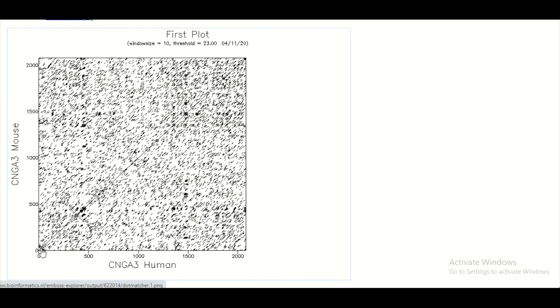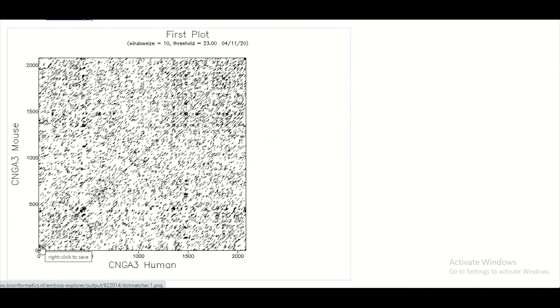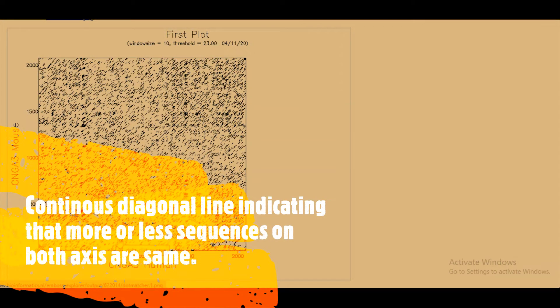You can see here that in the center of the graph you can find a straight diagonal line. Now this straight diagonal line is letting us know about the global alignment — from nucleotide number one to the last nucleotide, all of these sequences are compared with one another. This diagonal line is letting me know that more or less both sequences on the x-axis and the y-axis are similar.